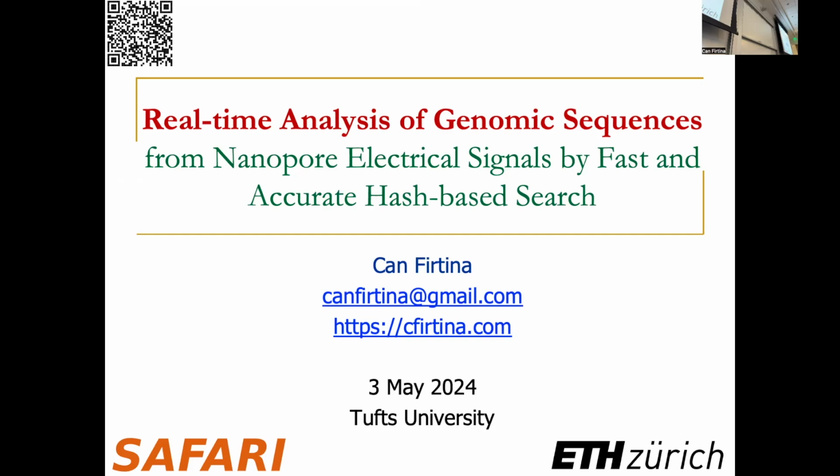And this is important because after some point, for example, if you sequence for 5 or 6 seconds, the DNA that is already sequenced grows a lot on the bottom part of the Nanopore. When you decide to eject it, the ejection process is basically that you switch the voltage such that the top side becomes positive charge and the bottom side becomes negative charge. So your DNA starts moving in the opposite direction, and it is sort of ejected from the Nanopore.